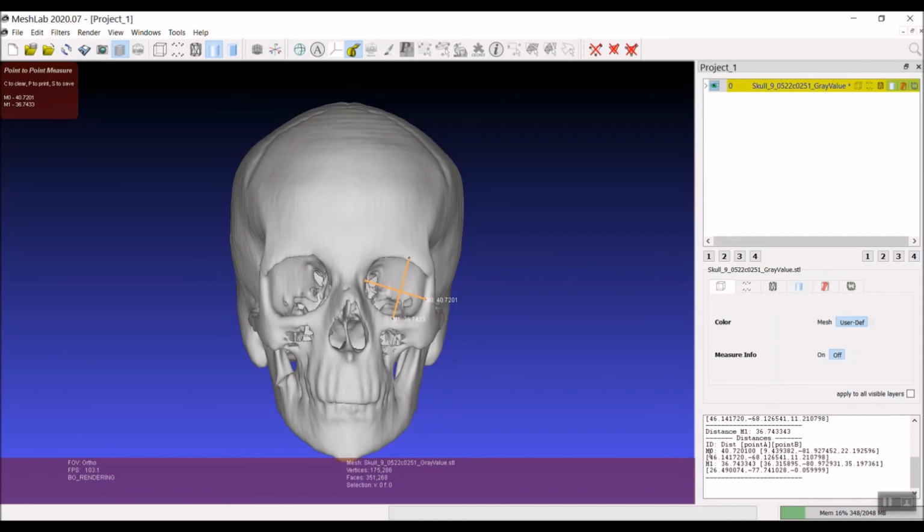and you'll notice that the measurements are getting numbered. If you're doing more than one measurement in a session, they start getting numbered from 0. So the first one is M0, the second one is M1, but again, you have the landmark coordinates spit out, and you could just keep on going if you wanted. You just keep dropping. M2 now. P. And the coordinates and the distances keep getting dropped in there.